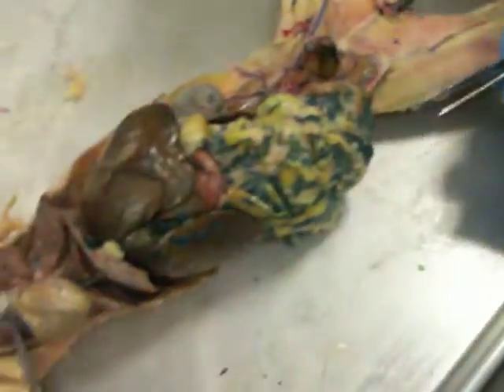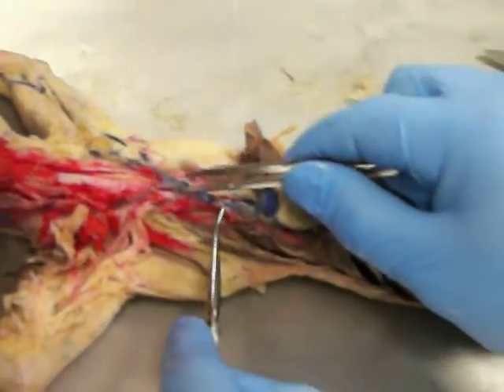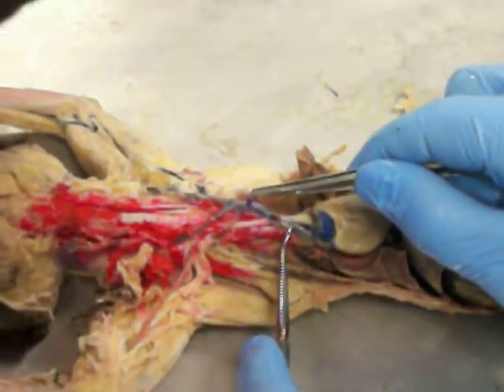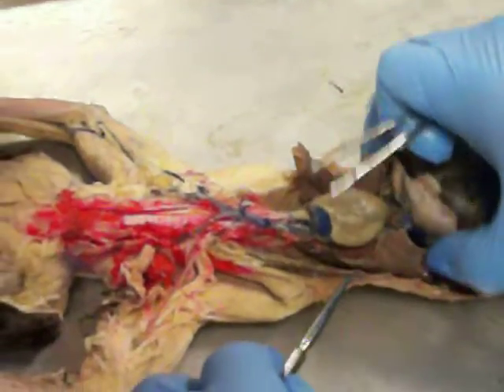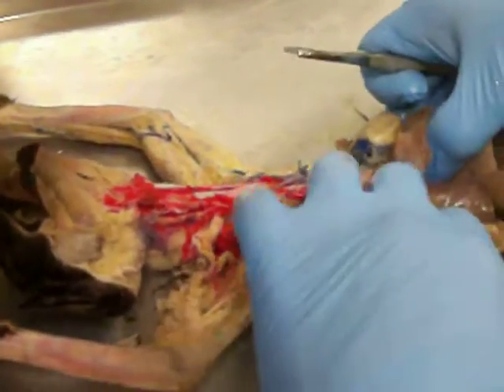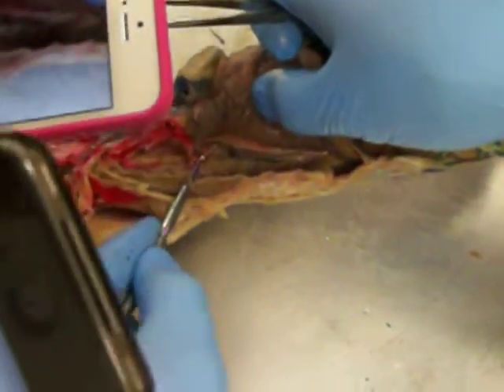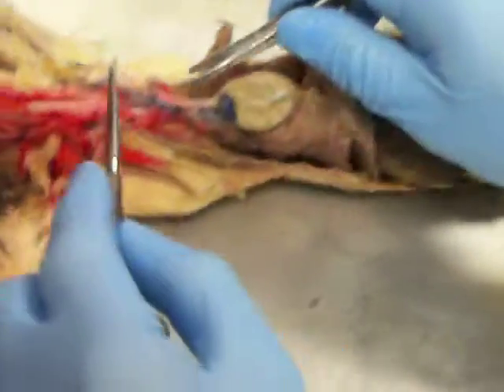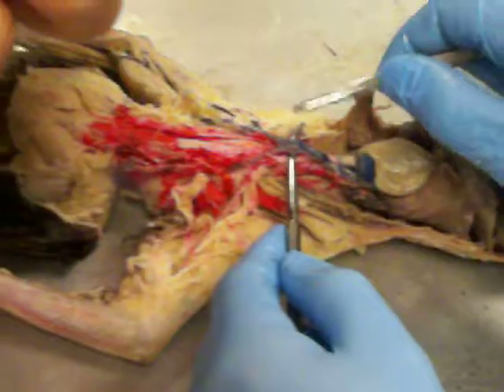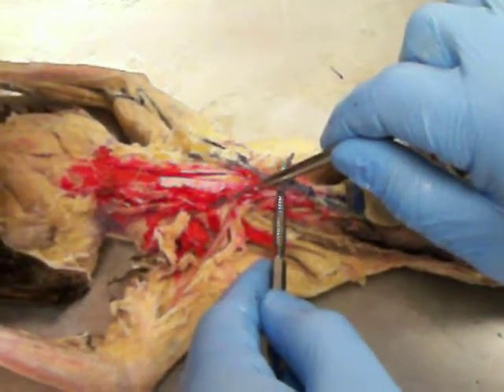Okay, now if we go over to the veins, we've got our heart again right here. This is our precava. This vein right here is our internal mammary vein that comes up perpendicular. Over here we have our azygous vein coming down right there. Now the precava is going to branch into the left brachiocephalic vein, right brachiocephalic vein.